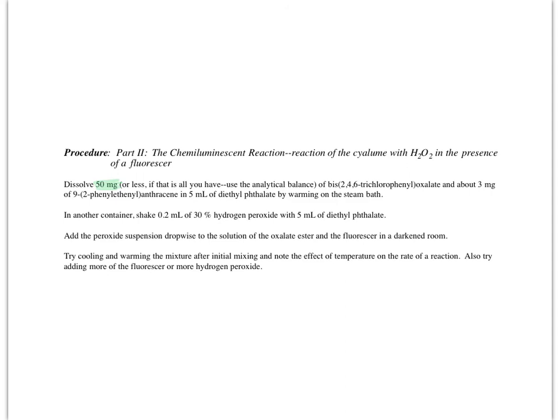We're going to use the analytical balance to get enough significant figures for the small amount we're using. So it's not going to take a lot of the bis 2,4,6 trichlorophenyl oxalate, and then about 3 milligrams of your fluorescer. So 3 milligrams is 0.003 grams.